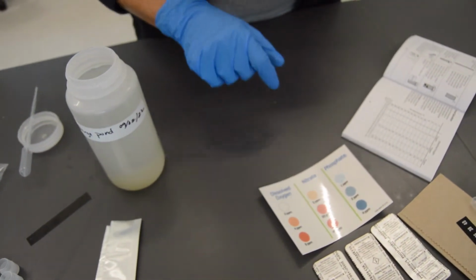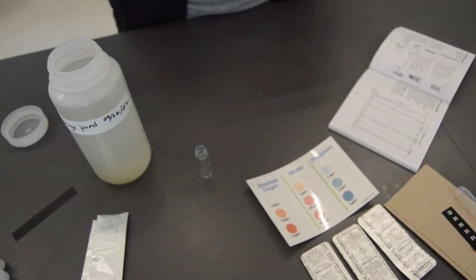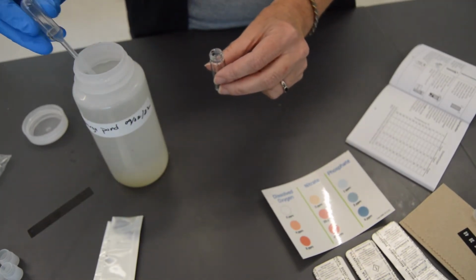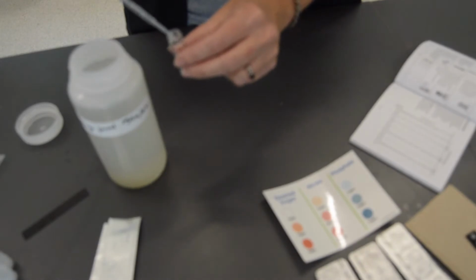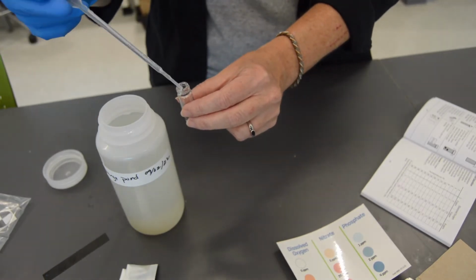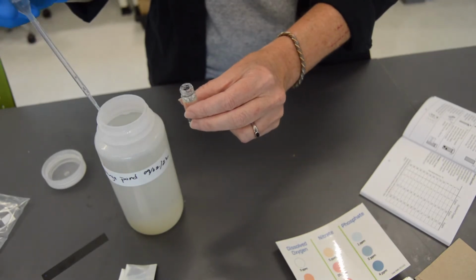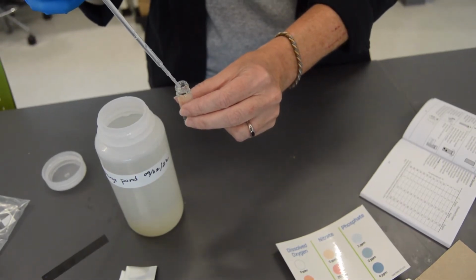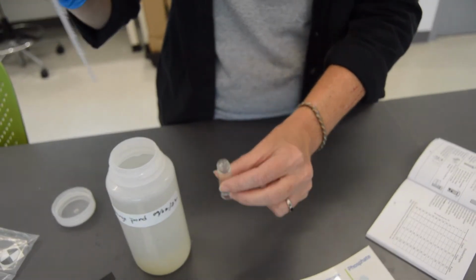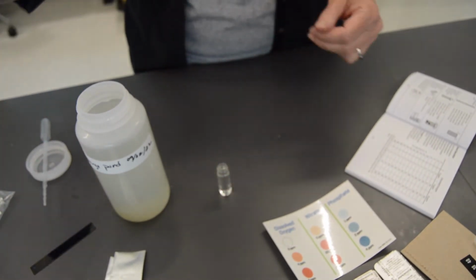And so then we're going to do our dissolved oxygen test. It's a fairly simple test. One thing about the dissolved oxygen test is that we want to make sure that we are filling our container all the way to the top. So it's important that you don't have any oxygen at the top of the vial. So we're going to fill it all the way to the brim, and then we're going to add our tablet, so it's going to overflow. So I suggest you have a secondary container you can put it in, so that you're not going to be getting wet tables if you're working with kids.